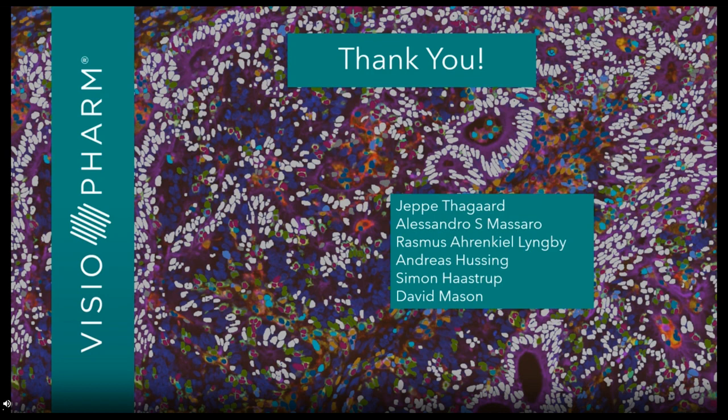The next question is: is the Phenograph module on the market? Can you explain a bit more what it is? I was just wondering if this is the clustering algorithm or something else.